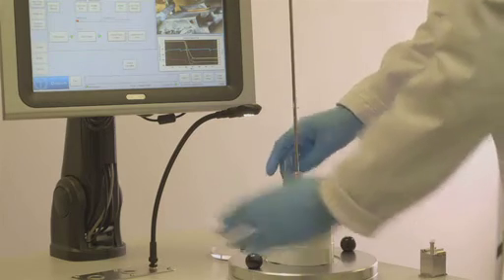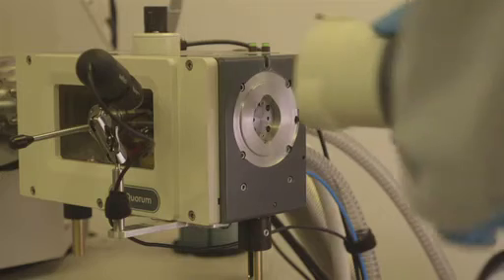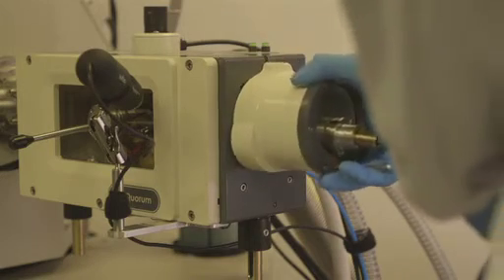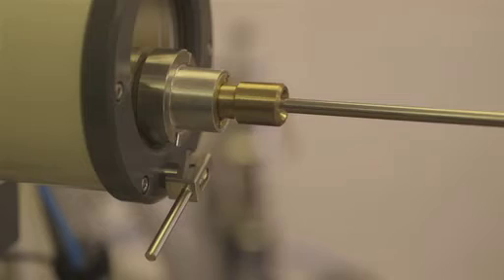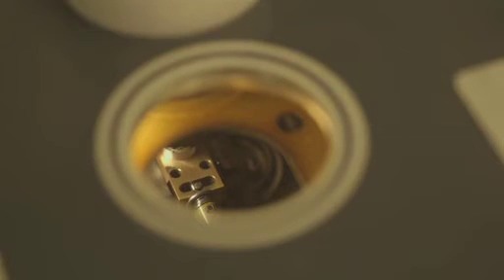The cryopreparation chamber is connected directly to a suitable microscope chamber port, and has its own floor-mounted turbo-molecular pumping system. The preparation chamber has superb visibility, and a video image of the cold stage and specimen is displayed on the control screen.